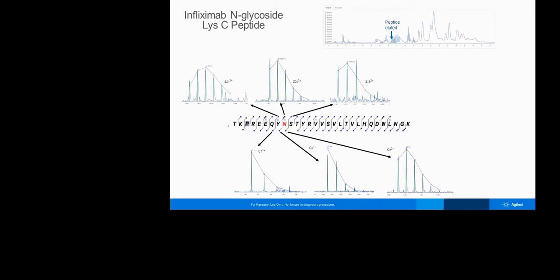There's also a leucine present 4 amino acids in from the carboxy terminus. And this is showing the spectrum that's seen here. So in this particular case, the side chain fragment is actually much more dominant than the main chain fragment, the Z4. And that has to do with the ions being activated and the side chain fragmentation coming apart very quickly after the electron capture event. So we're getting exceptional coverage of side chain fragmentations that really helps with identification. It's also very useful with the side chain fragmentation to note that that breaks cysteine bonds.